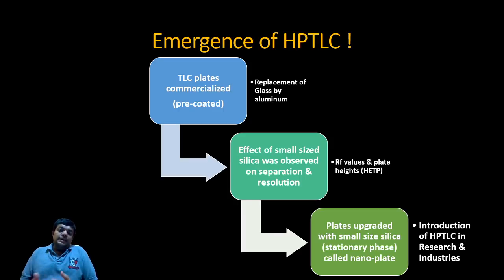And these aluminum plates then started being marketed and reached the industries as well as the researchers. So these plates were now commercialized and pre-coated with silica. And it was seen that as they were pre-coated, the particles coated on them were of small size and its effect was observed on separation and resolution.